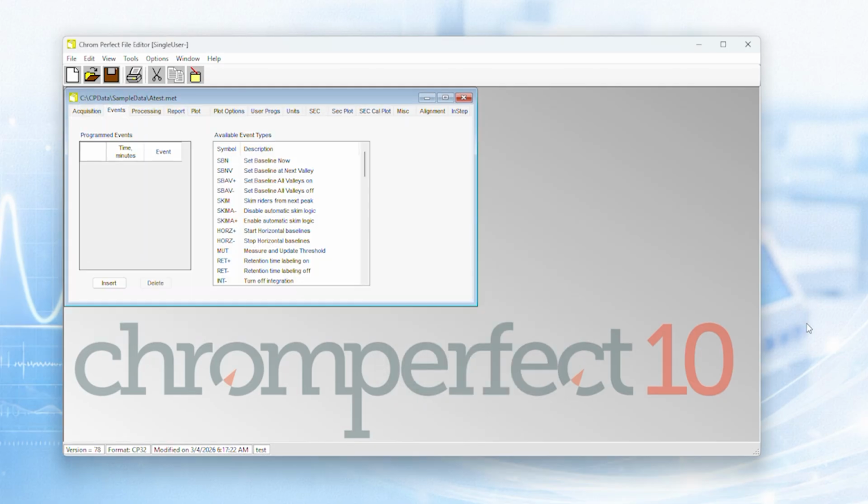Next is the Events tab. The Events tab contains timed integration events. These are instructions that modify how the chromatogram is interpreted at specific times during the run. Events do not change raw data. They change how peaks are interpreted.